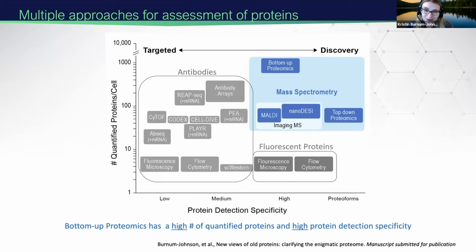Although bottom-up proteomics will be our main focus, we will also discuss top-down proteomics for intact protein measurements and in situ measurements, where sampling is done directly from the surface of the sample, such as with MALDI, or matrix-assisted laser desorption ionization, measurements. Throughout the day, we'll be covering multiple proteomic methods at a high level to introduce the concept, or at an in-depth level for methods that we routinely use and want to emphasize.